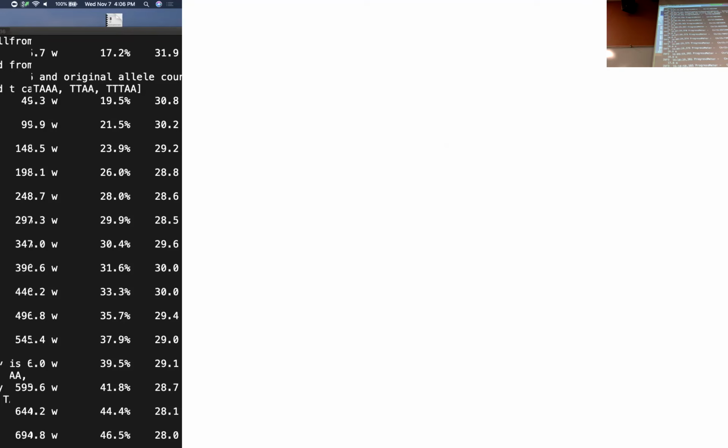So it basically takes those reads and does an assembly, and then infers how many haplotypes you have. Do you know what a haplotype is? And that's why it's called a haplotype caller, if you look up there.